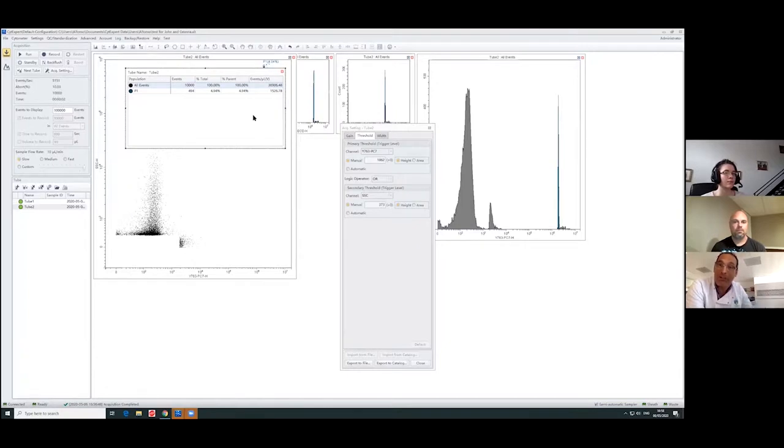And it's also giving us some stability analysis. So we can see that it's not a spike, it's not a problem with the fluidics. We have analyzed everything in the perfect timing. So time is, again, a very important key here.